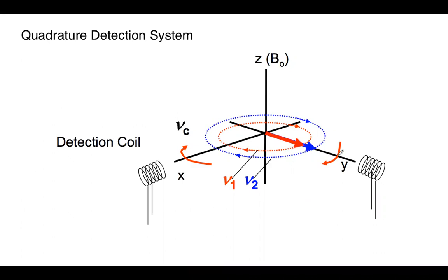So one of the things that we can do is increase the number of detectors. This is not always easily done because of the shape and size limitations of our spectrometers. So usually there's just one, but if you have a particularly nice setup, you can have 2. And this then enables us to sample at 2 positions, one maybe along the y-axis, the other along the x-axis. So these are perpendicular to each other, 90 degrees separated from each other.